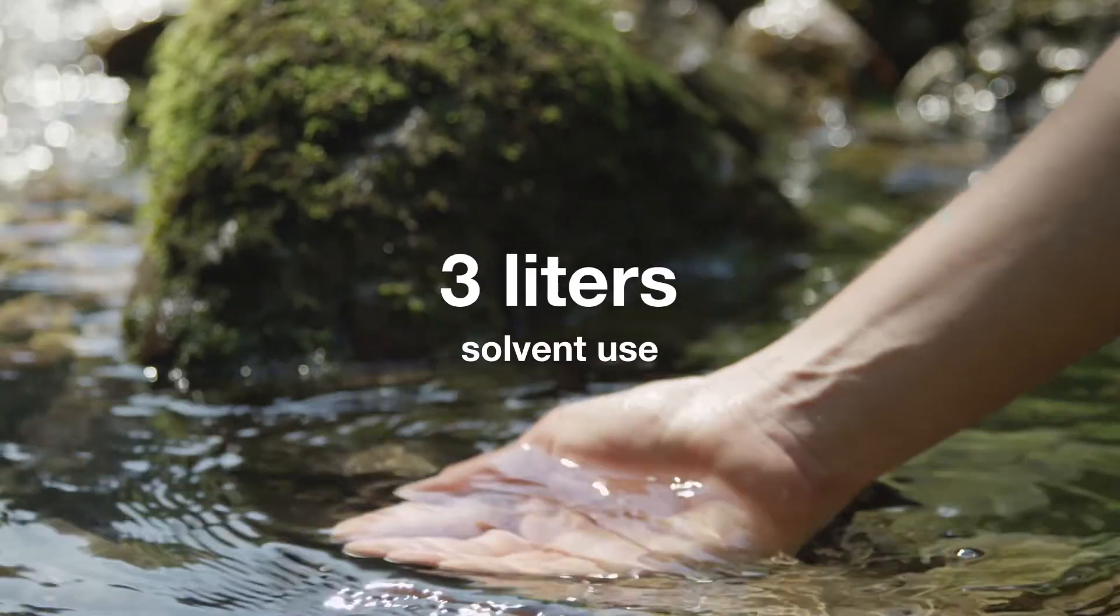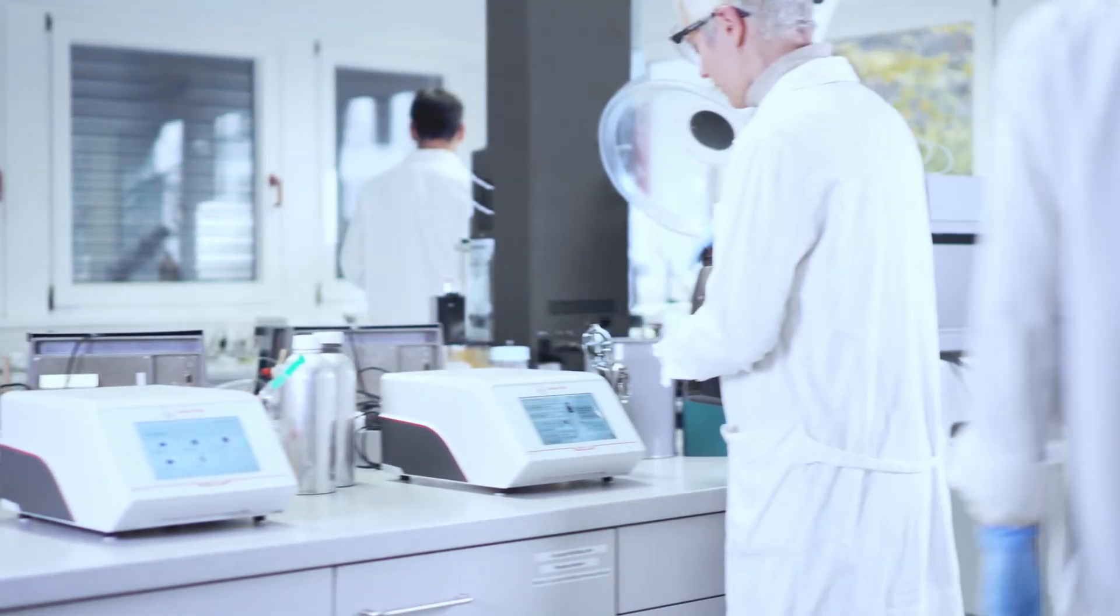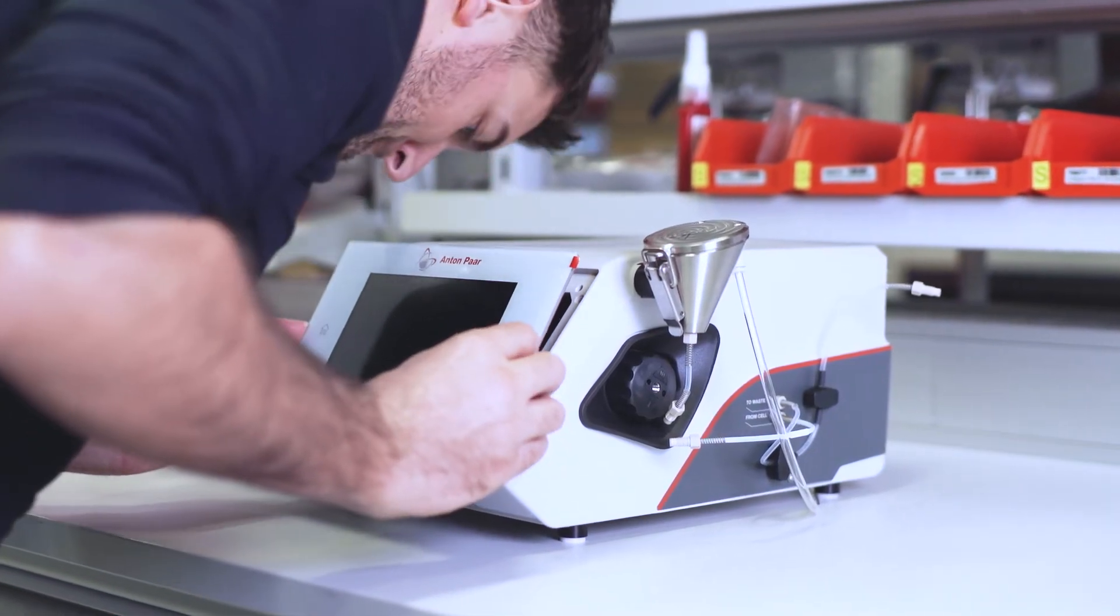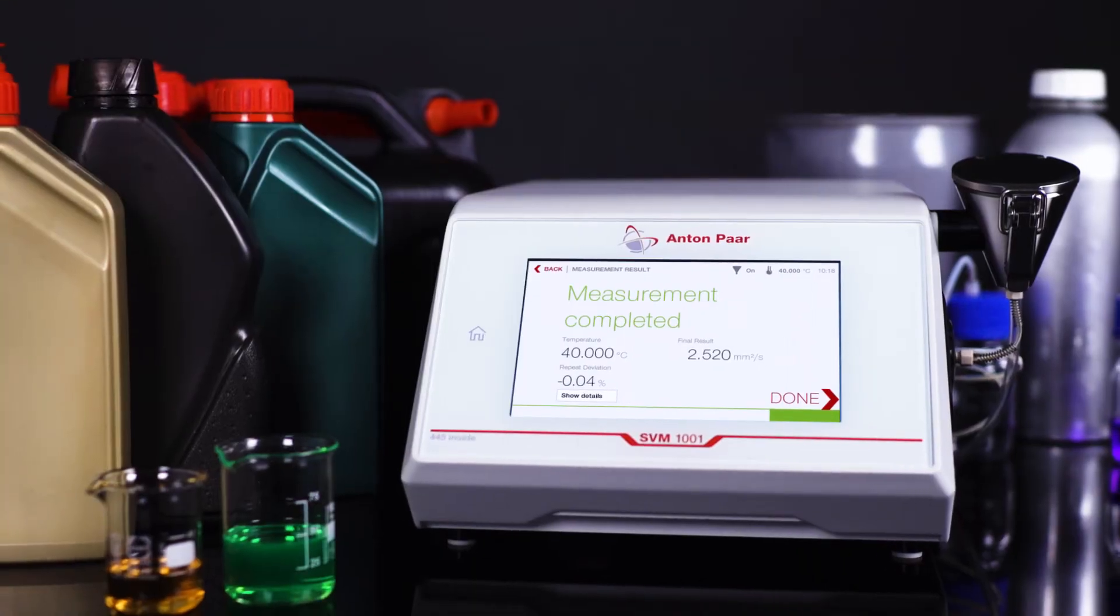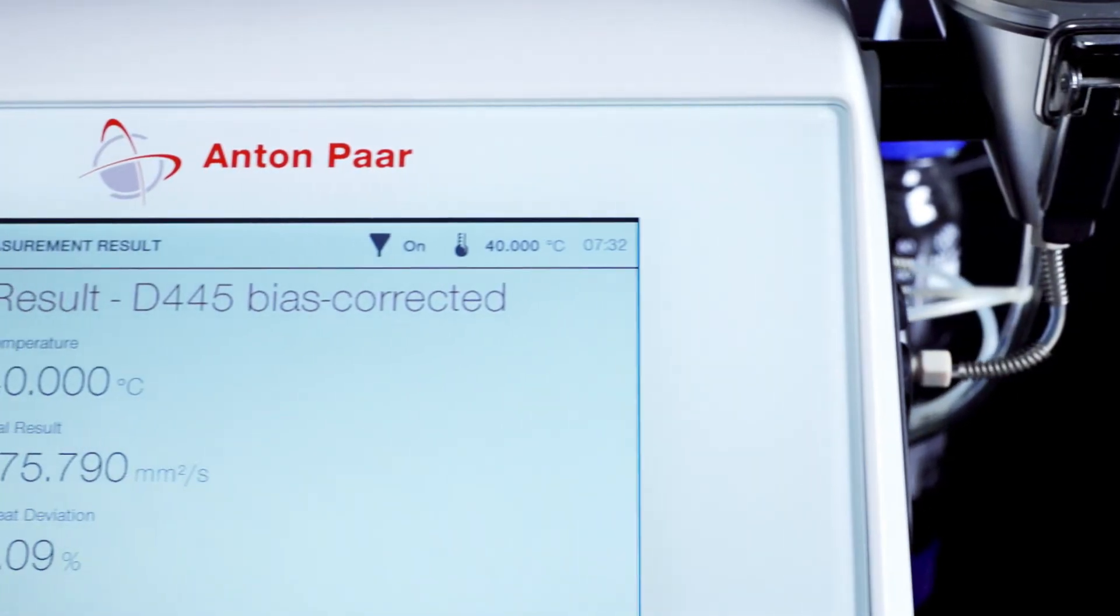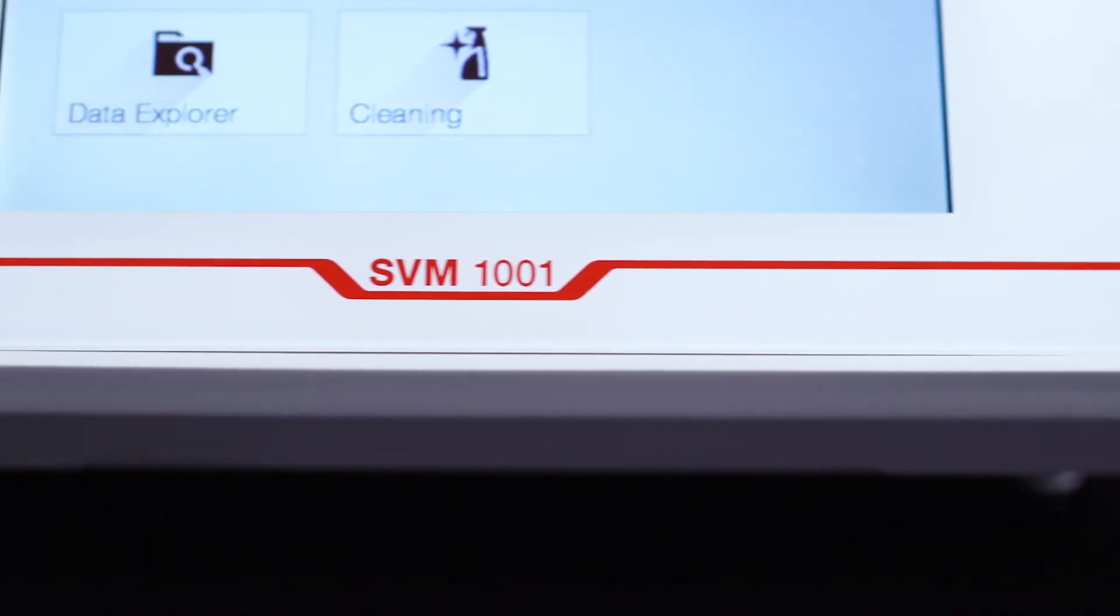SVM 1001 brings change to an entire industry while keeping on board what's made to endure. Standard compliance is key. All our kinematic viscometers deliver results in both ASTM D7042 and ASTM D445.